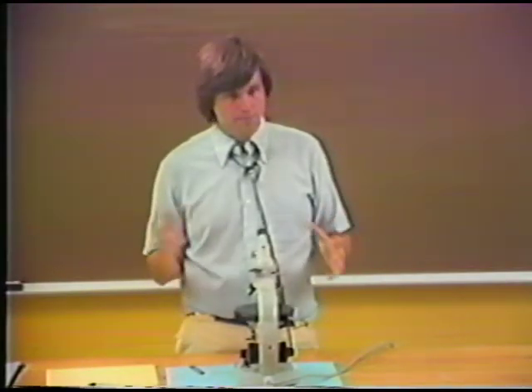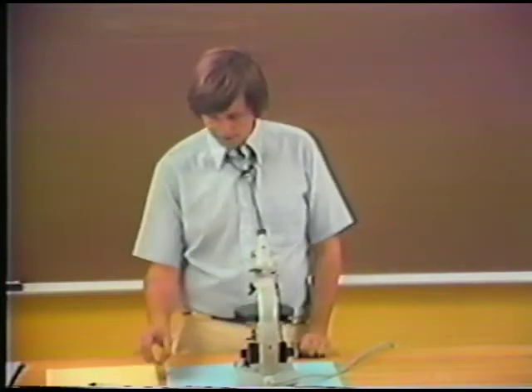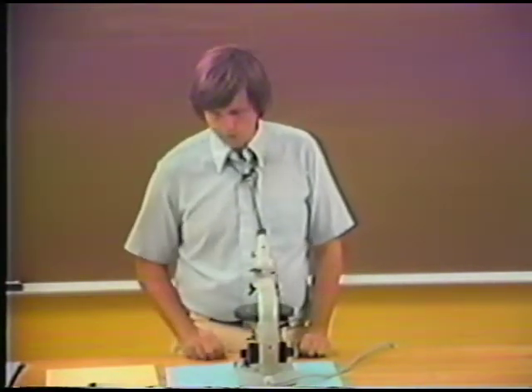Now the application of the quartz wedge is particularly important when you see a confusion of interference colors, and the interference colors are variable from the edge, evidently as a function of thickness. It's very easy to locate the slow ray using the quartz wedge.